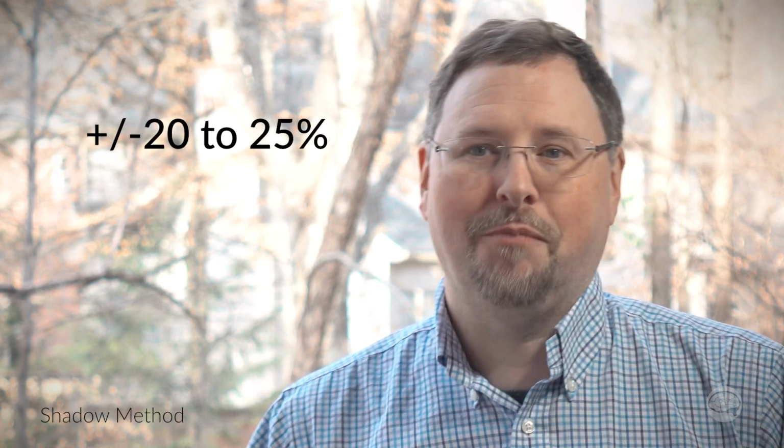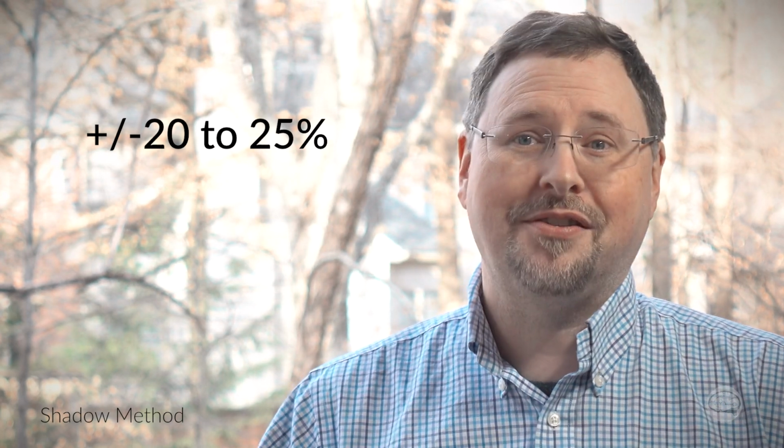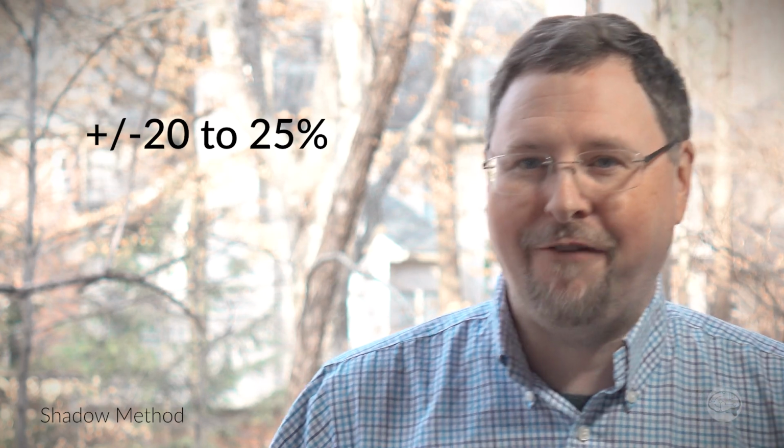Well, without getting off onto a big discussion about accuracy versus precision, most of these software companies will say that their reconstructions will have an error rate of plus or minus 20% or maybe 25%. That means if the actual height of your structure is 100 and you take several measurements, you should get answers somewhere between 75 and 125.